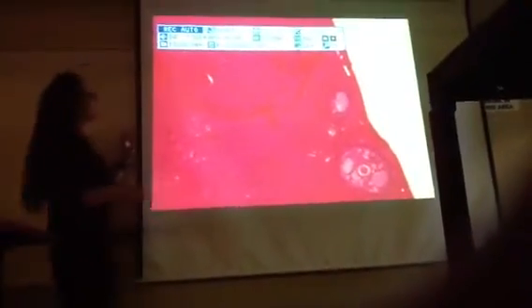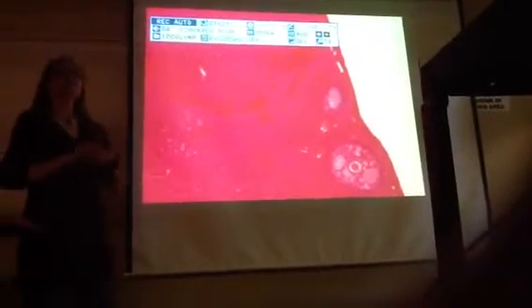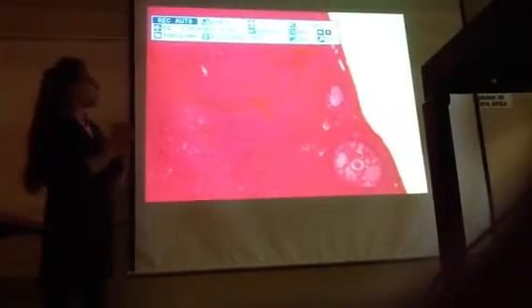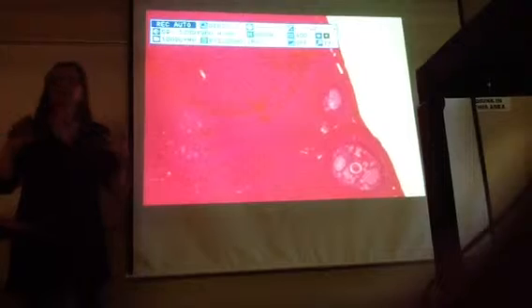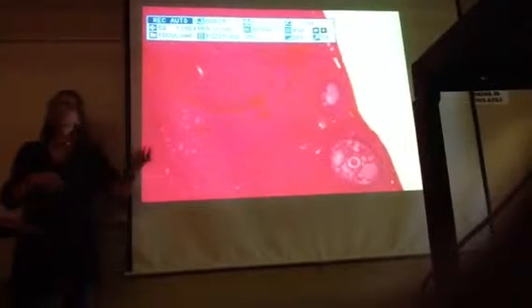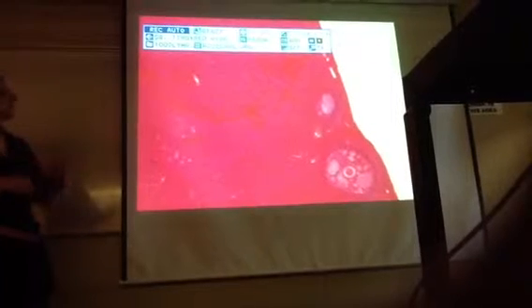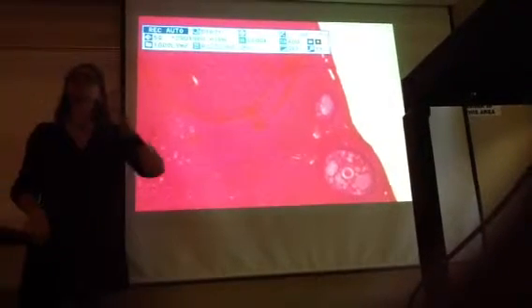And what you want to see on the ovary is follicles, and in those follicles you want to see oocytes. We'll talk about this tomorrow, how oogenesis happens. But when you look at the ovary, you're going to look out to the edge, and out on the edge is where you're going to see the follicles. Follicles are basically just layers of cells. It could be a single layer if it's a really young follicle. If it's a more mature follicle, there'll be more layers of cells. But follicles are just layers of cells, and inside of the follicle is the oocyte.